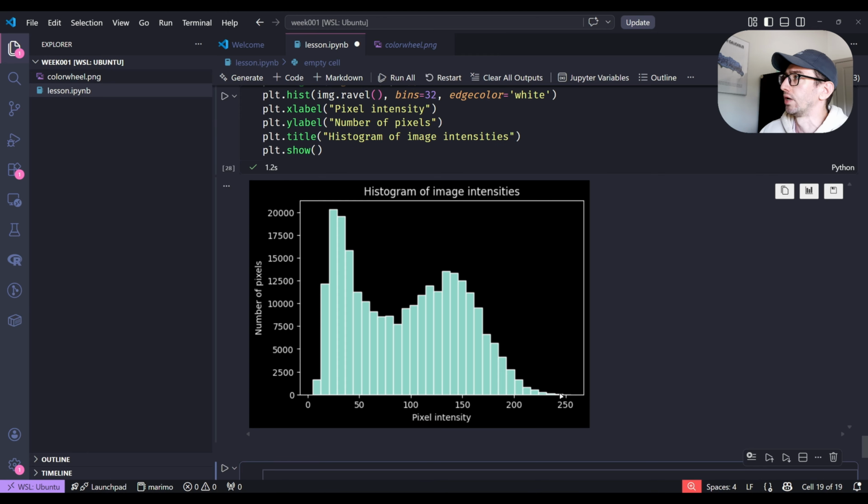And basically by looking at the histogram, we can get some idea of the image. So for example, guys, when you look at this histogram, do you have any thoughts in your mind? For example, you didn't see the image first and you just got the histogram with this nuclei staining, and now the idea is whether we can say something about the image even without looking at it.